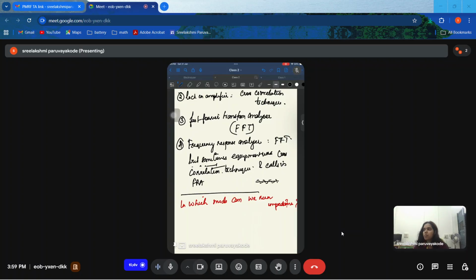So basically it is more or less that DC bias value, but it is actually oscillating around it. So the system is not disturbed from the equilibrium, it goes slightly here and then comes back, and then we take the response. So the DC bias is superimposed by the AC bias. This DC and AC bias can be either in current mode or in potential mode.